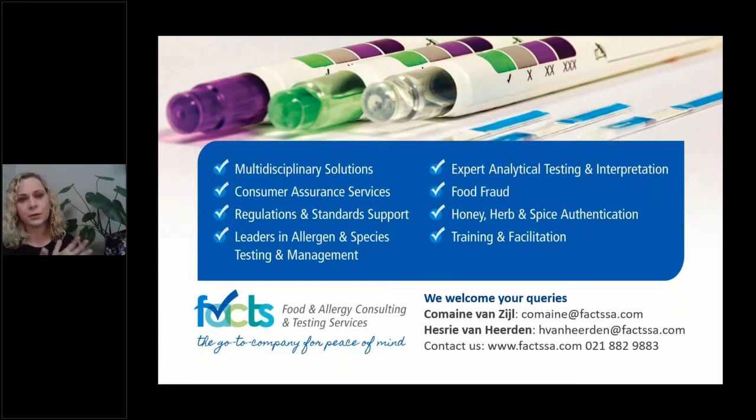Generally you will just test a positive control. Yes, the allergen is there, it is detected, and then after cleaning, swab and test the product, or swabs or products, to determine whether everything has been removed. But it does play a role when you're actually doing checking, matrix checking for screening.